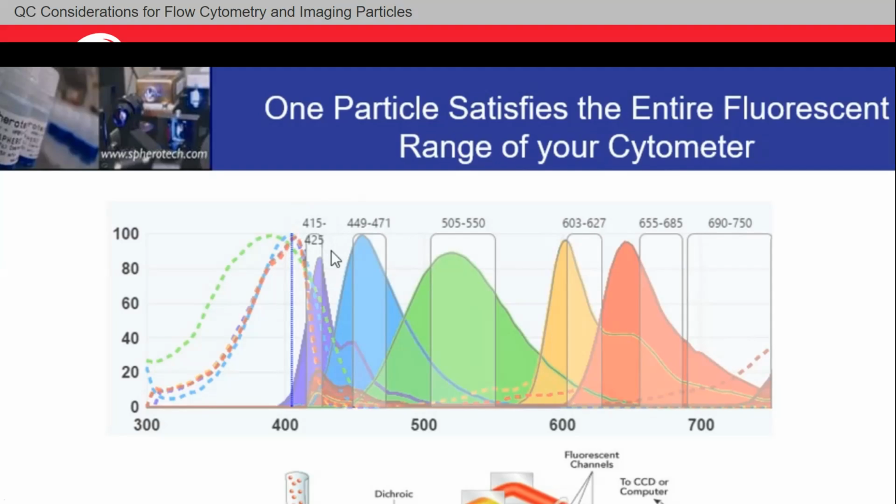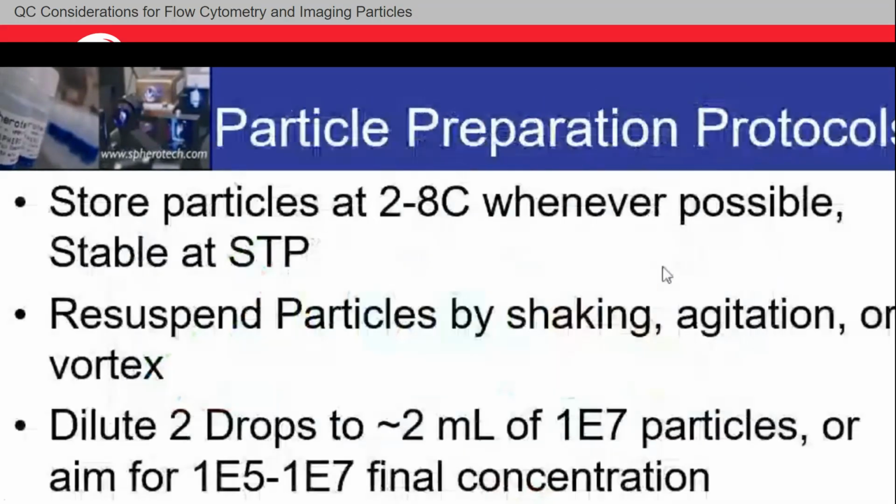And you might even be able to change the name of your filter channel in your software for your given runs. So it's good to know, are you calling this FITC? Are you calling it B540? Are you calling it B537? These oftentimes are the same filter or very, very similar, right? We'll get into some names like PE-Texas Red, ECD, right? Very, very cool. So this is one example of the anatomy of a flow cytometer.